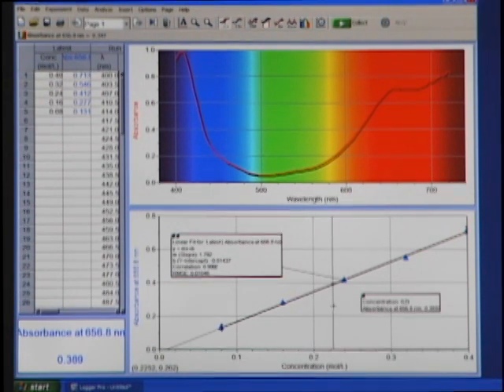And so I'm going to move this until that absorbance value is 0.356 or as close as I can get to it. So there's 0.357. And I notice that the corresponding concentration is 0.21 molar, which is very close to the concentration that I prepared.